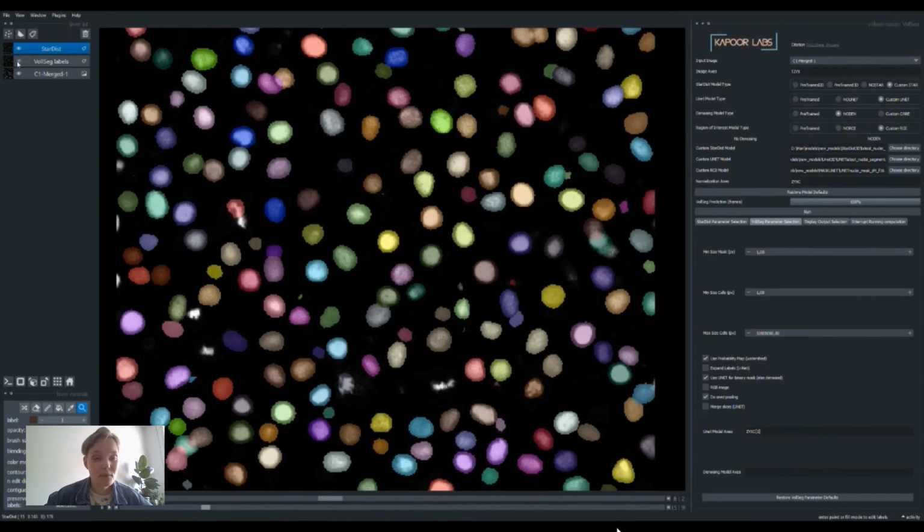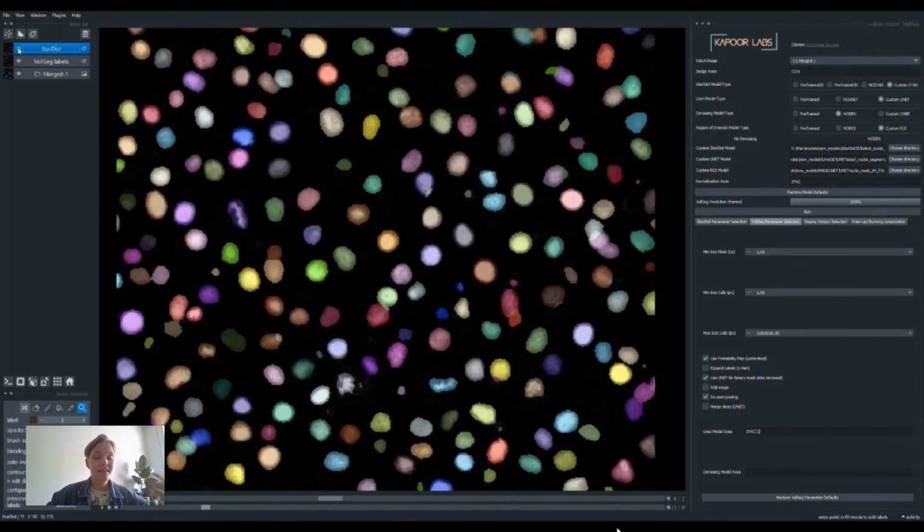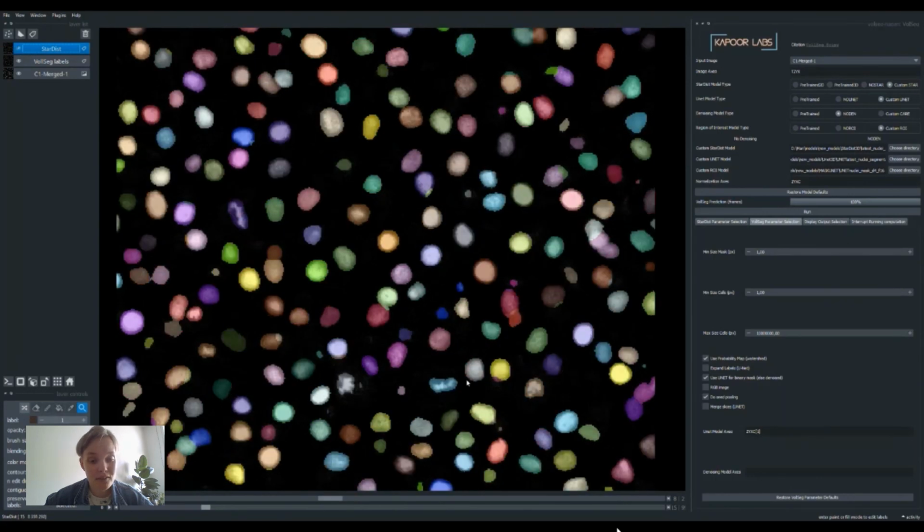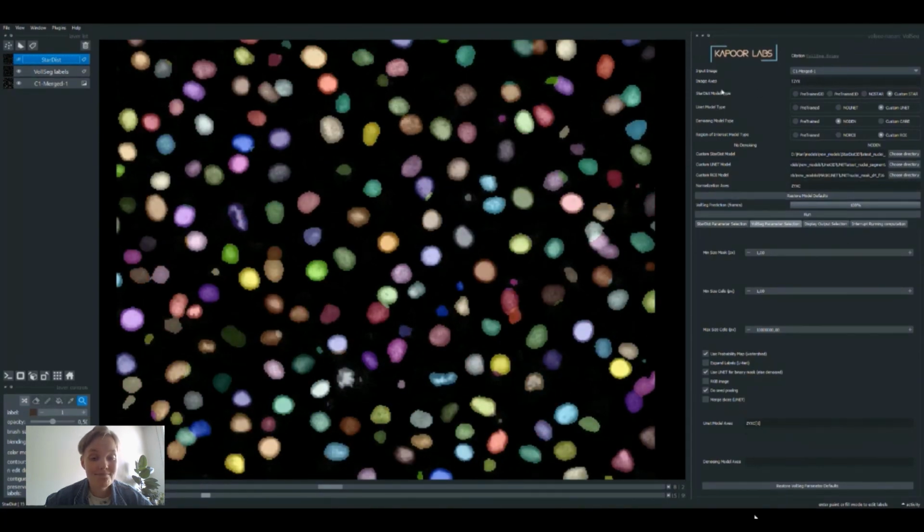Now, because we're doing seed pooling with VollSeg, where both the Stardist and the unit seeds are taken into account, I actually also end up segmenting these cells nicely. So that's it. Happy segmenting.